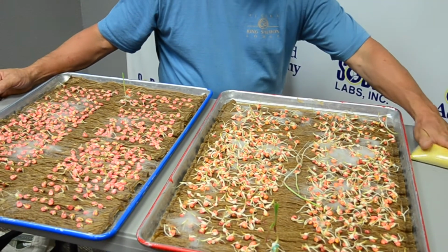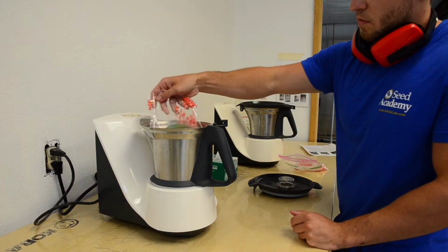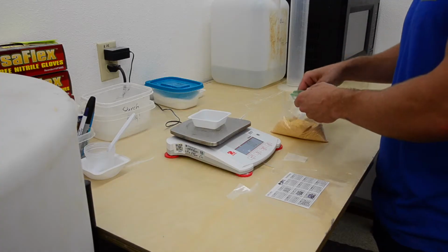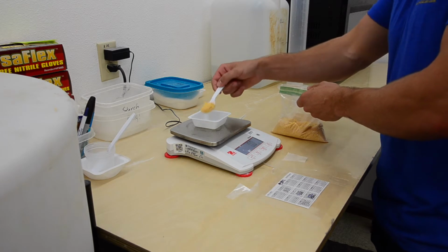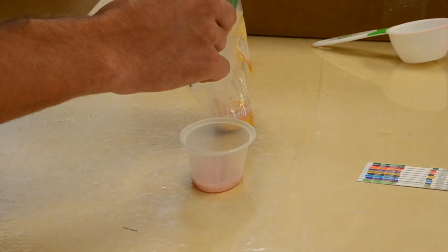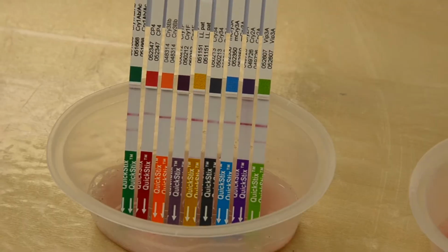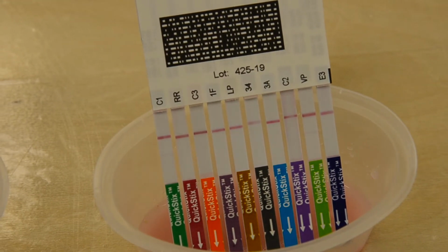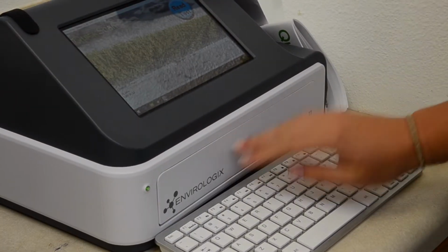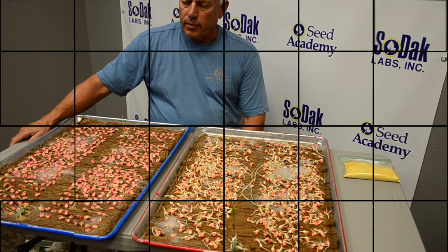Now, on the insect traits, we can't be quite as quantitative. 300 seeds are ground up into a pool, and we call it a pool because we can find 1 in 300. Then we do 3 or 4 pools of ground material, and we estimate using a calculation the amount of GMO for the insect traits. And then we report these 3 together. So it gives you sort of an overview of the amount of GMO you'd expect in that conventional, or it could even be organic, seed corn.